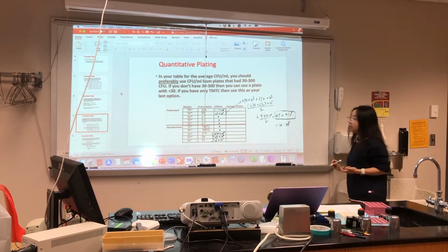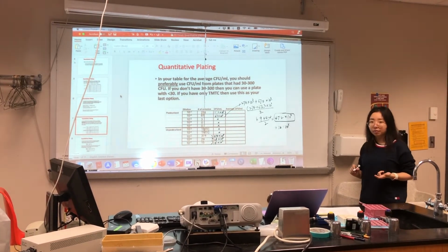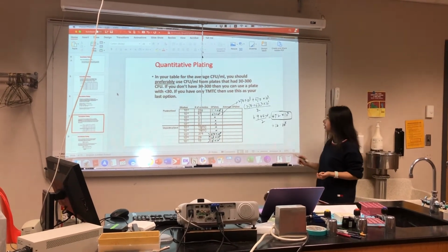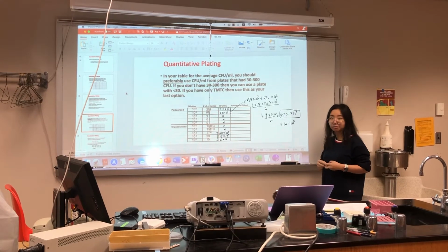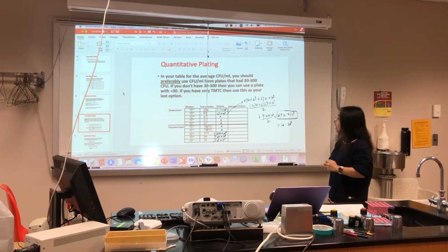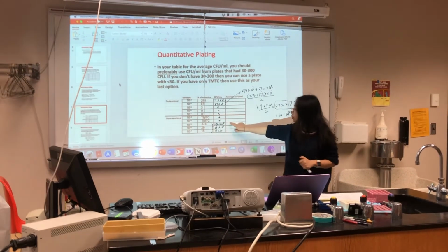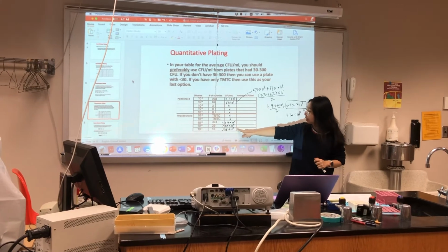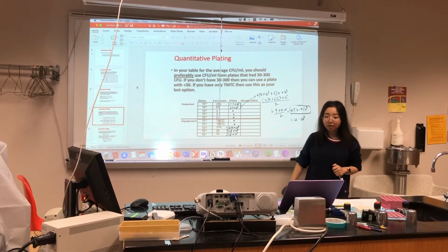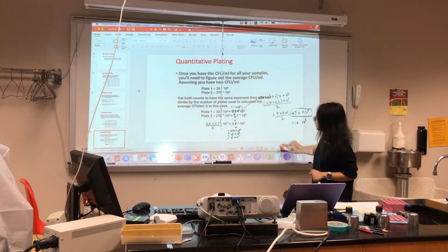So this is the final average, CFU per ml for your pasteurized raw milk sample. If I calculated it wrong, indicate to me, or we are going to move on. You're supposed to know how to do the average per ml. Use these 3 numbers. We are going to talk about this concept again.